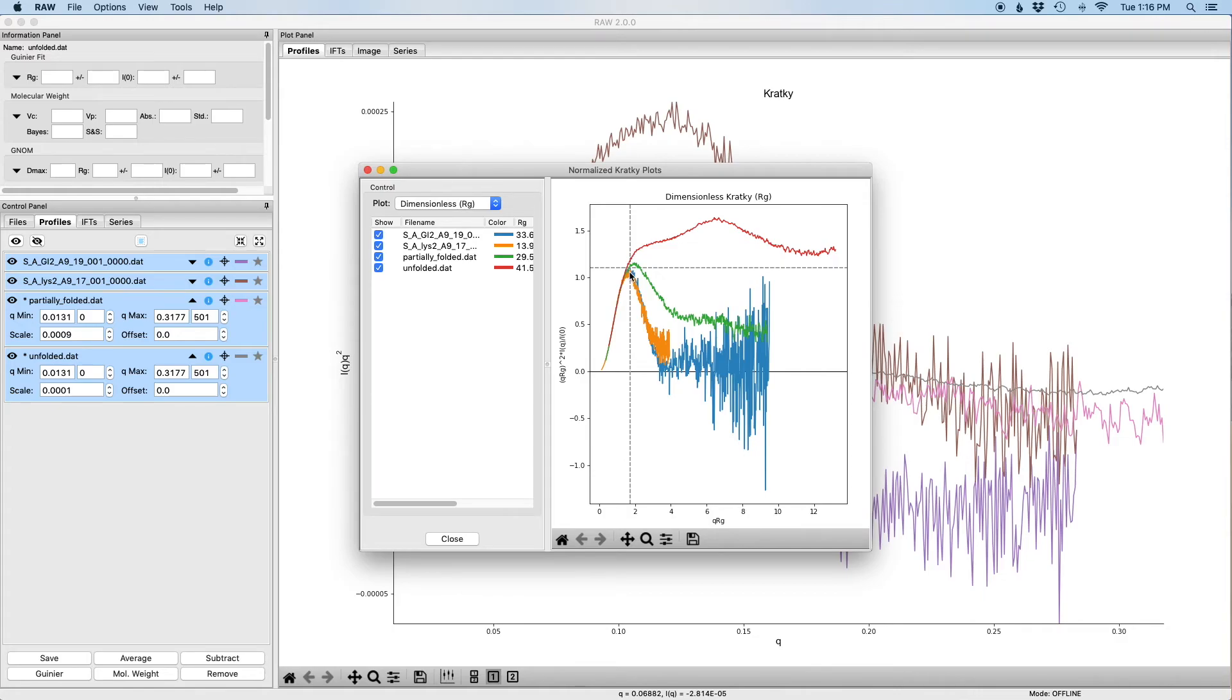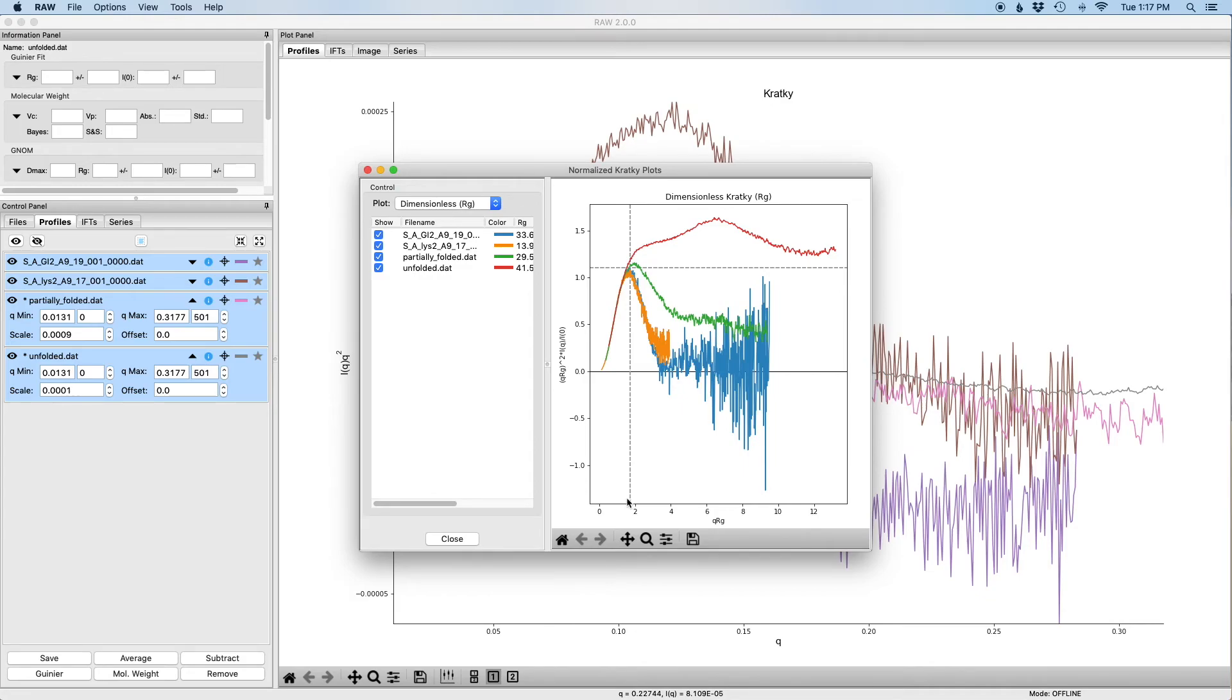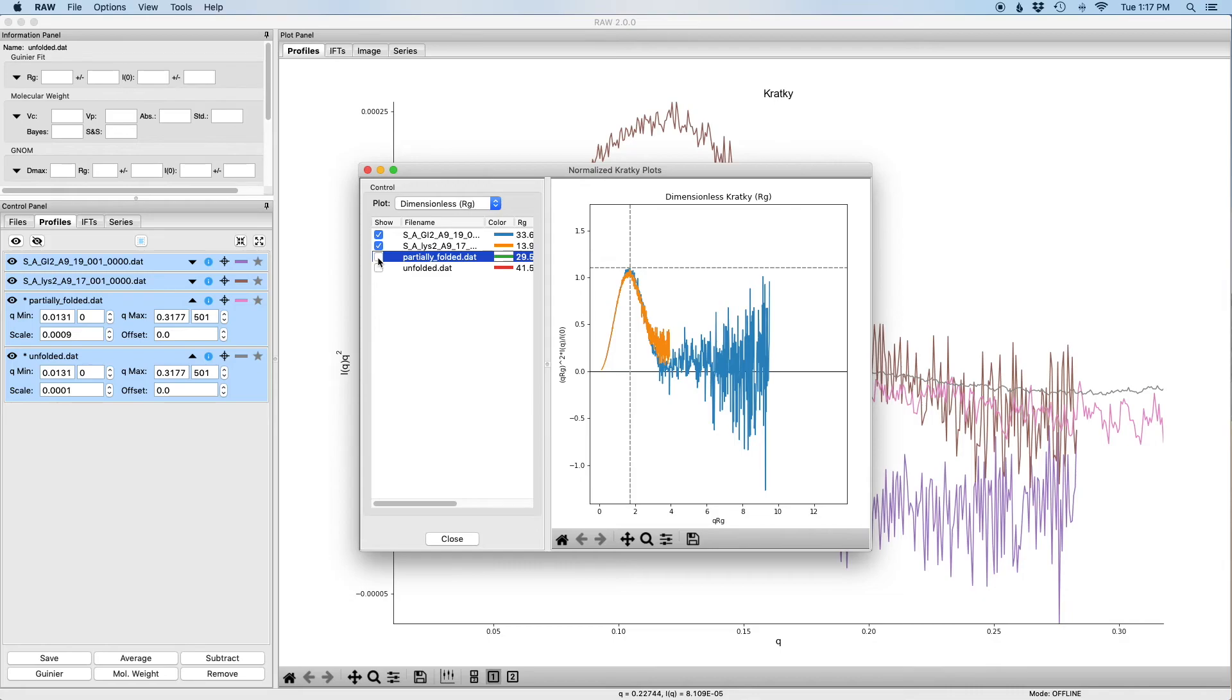The dashed gray lines show where you expect the peak to be for a globular protein. This happens to be at a maximum of about 1.1 and at a q times rg of about 1.73. We can also control what's shown on the plot over here. If I just check these check boxes, you can see that that removes items from the plot and then I can add them back.